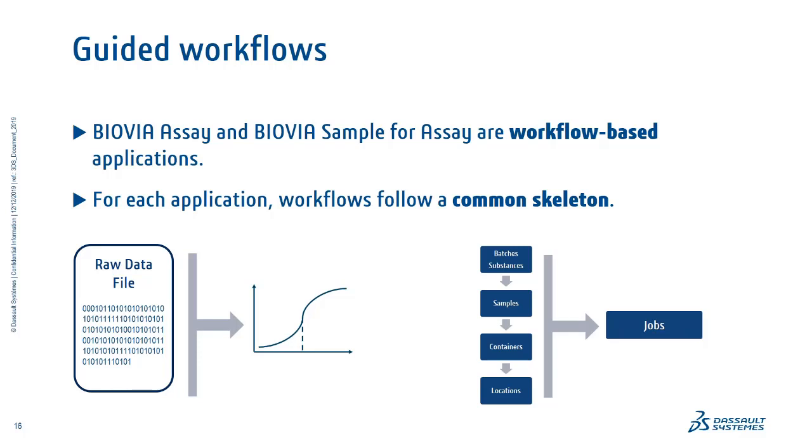In both cases, and as I said already, both applications are workflow-based applications. And for each application, the workflows are built on a common skeleton. In the case of BIOVIA Assay, that workflow is about taking raw data, taking them through all necessary steps, and getting the final results.